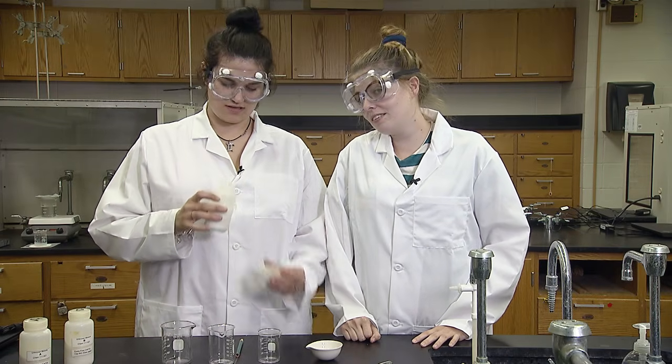Today in lab, we will be separating a mixture of 3 solids: silicon dioxide, sodium chloride, and calcium carbonate, also known as sand, salt, and chalk. Sophie, how are you going to get these tiny grains separated? We will use differences in physical properties, Jenny, like one of the solids will dissolve in water.